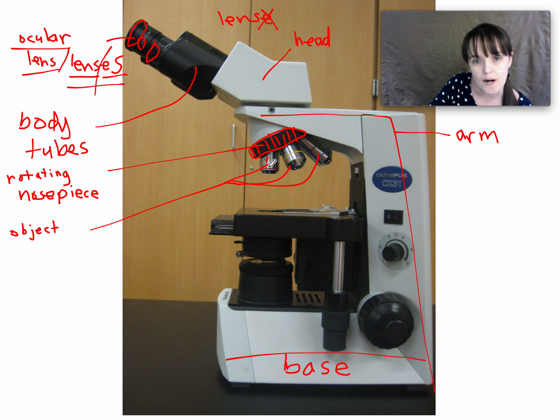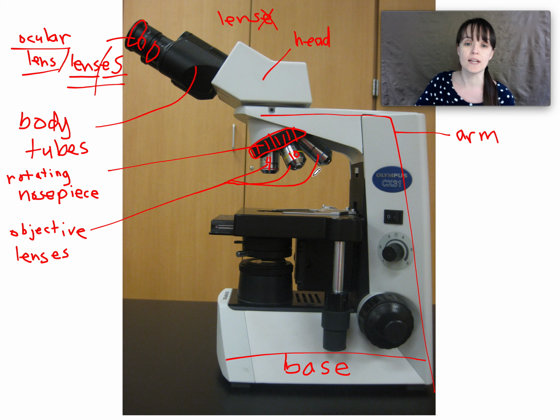This is the low-powered objective lens. I think it's a 4. The yellow is a 10. I forget what the blue one is. The blue one is more than 10. Lenses. Okay, so the thing about the objective lenses, oh, and these will multiply. So that's 40 times, 100 times, and more than 100 times magnified.